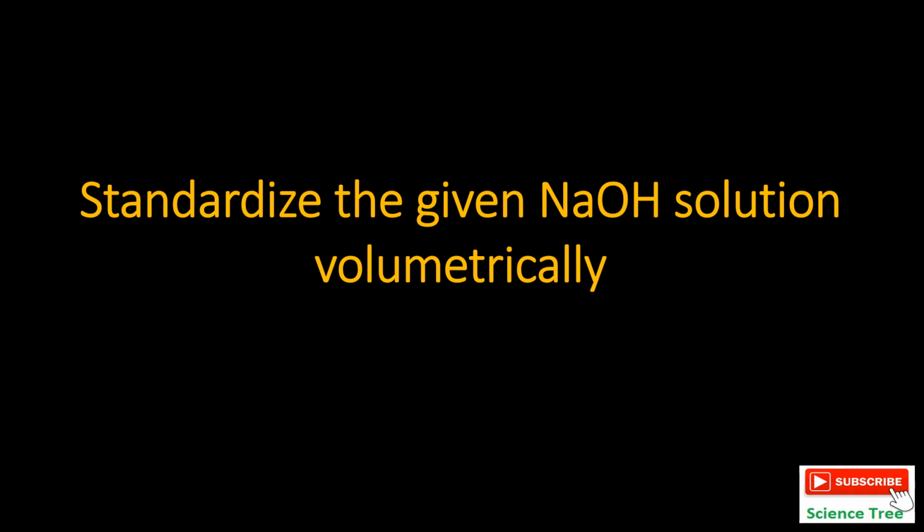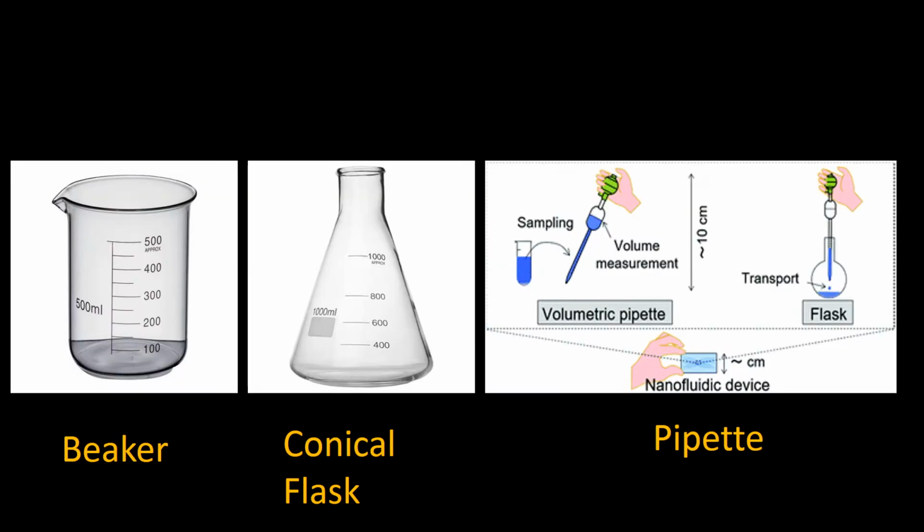So let's start. Number one is the beaker. It is shaped like the beak of a bird, so that's why it is known as a beaker, and it has measurements over it, so we can say that it is calibrated so that we can easily measure the solutions in it. As we know, in chemistry we deal with measurements. We deal with all the substances and all the solutions in a proper measured form. So that's why we use these apparatus.